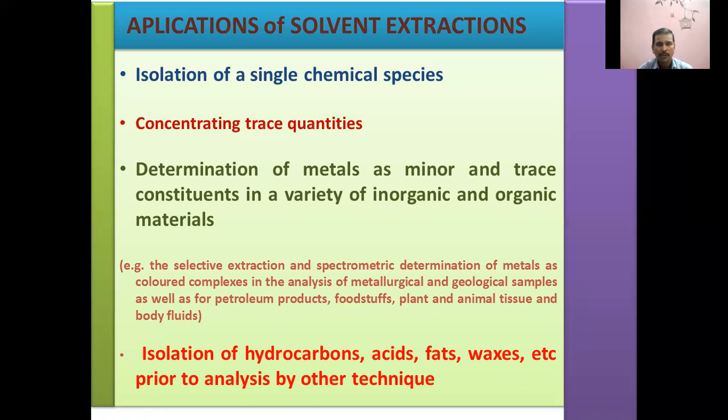So solvent extraction is not only a simple separation technique, it is very useful in concentrating the metal, and it will also assist in the quantification of the solute more accurately. We don't lose even a very small quantity of the solute. This is going to be a highly accurate technique.